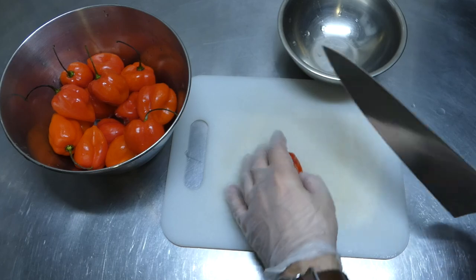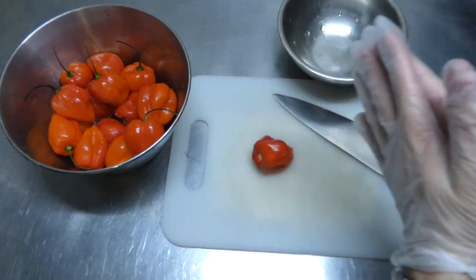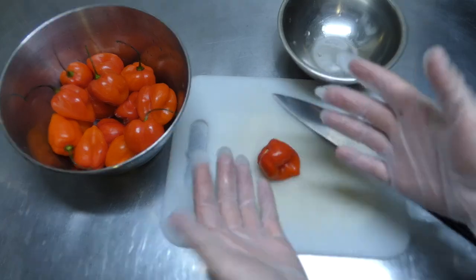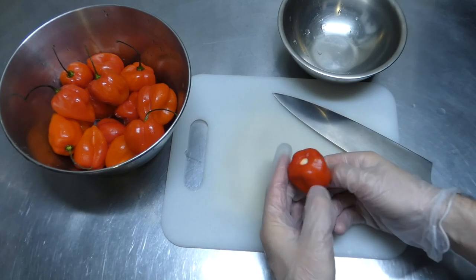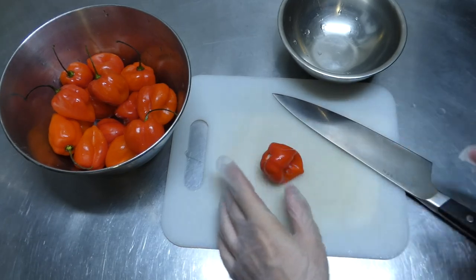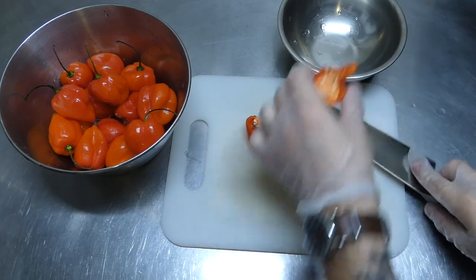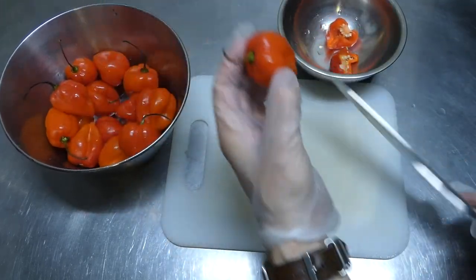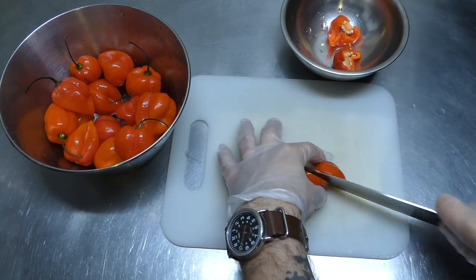Also, you wanna make sure to leave the seeds in if you're gonna be extracting the capsaicin. And also, whenever you're dealing with hot peppers, wear gloves because you do not wanna rub your face or your groin area afterward because you will not be feeling great. So, just cut these in half, like so, and just pop them in that bowl. I'm leaving the stems and everything right on because I want to extract as much as we can.